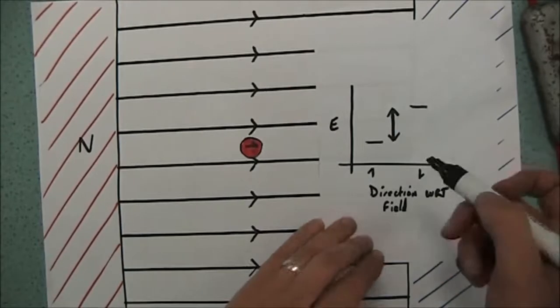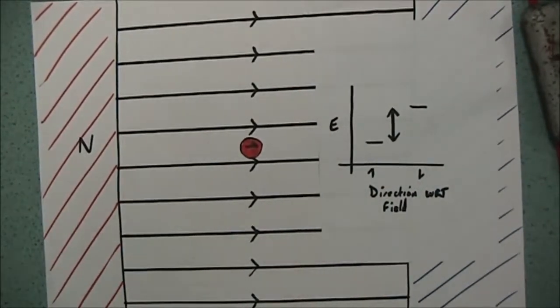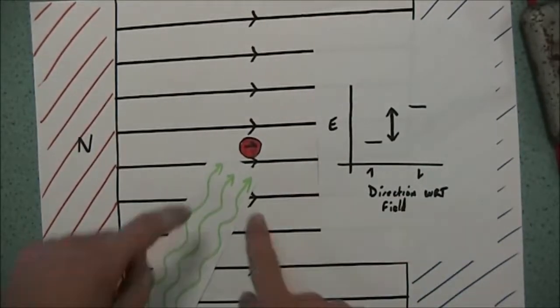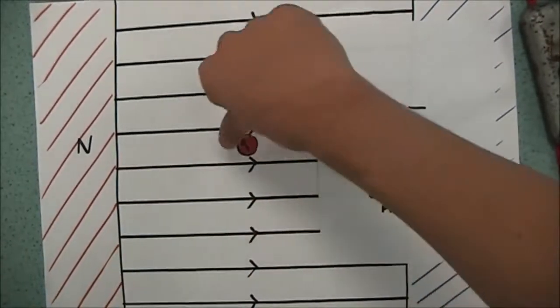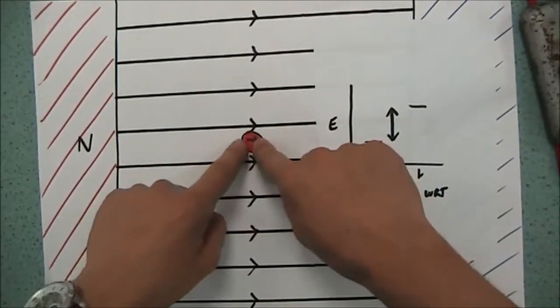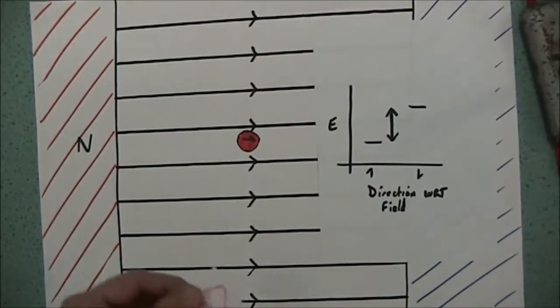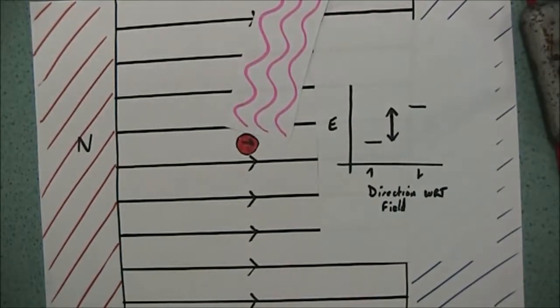Okay. So how are we going to turn it around to this high energy state? Well, what we're going to do is take some radio waves and zap the nucleus with the radio waves, and that will align it against the magnetic field, and then it will turn back, and as it oscillates it will actually give out radio waves of a slightly different frequency.